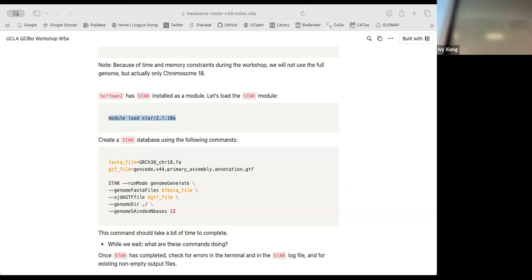Are you deleting certain files in this case? Like, because it's saying deleted. Oh, wait, I might be misunderstanding. Right, that means once you unzip it, the gzip file would be gone. You only have the unzipped file left.